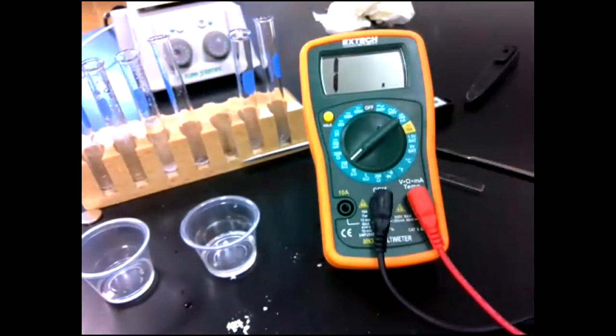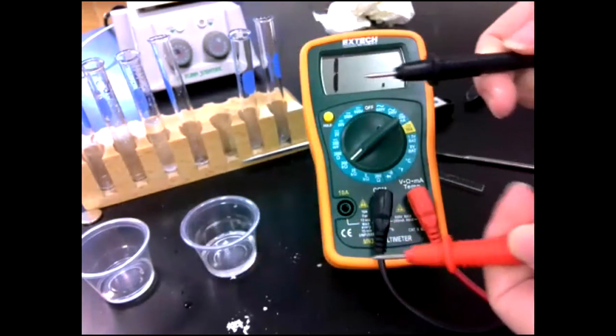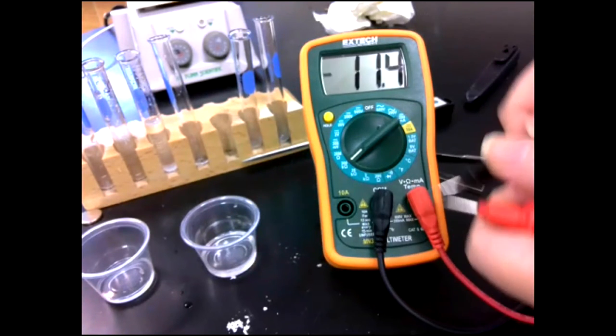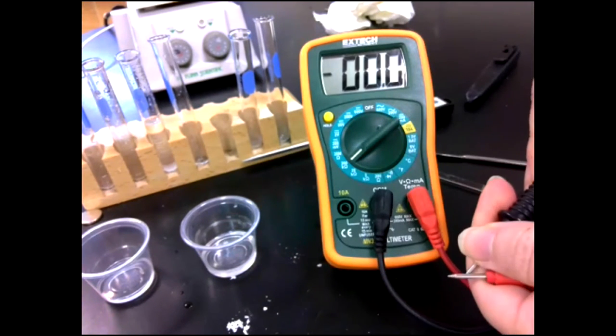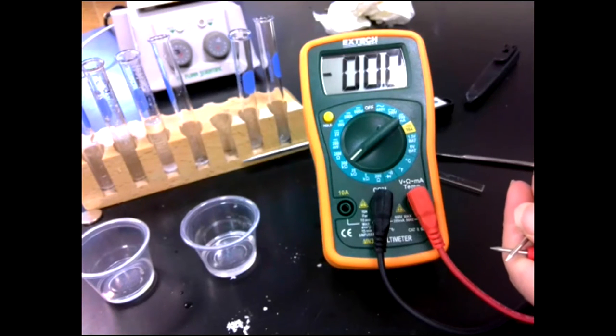And I don't know if you can see this, the light is shining on here. The one means there's no conductivity, which makes sense because my probes are separated. They're not touching anything. If I touch them, the best test, in case you ever want to use one of these, if you touch them to each other, they're metal. So they're definitely going to conduct electricity between them. Hold it still. And it goes down to zero. Let's see that.